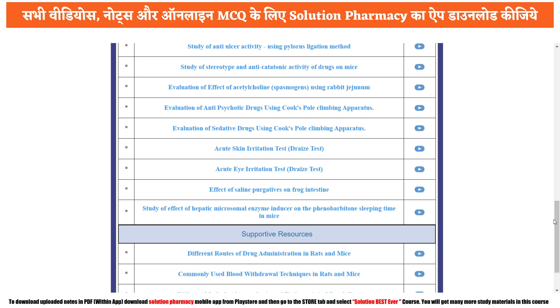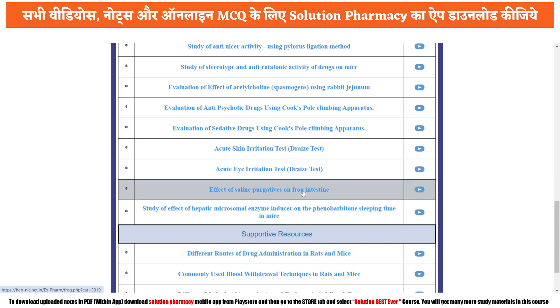Hello friend, welcome to the channel. You are watching xform exclusive video series on Solution Pharmacy YouTube channel. In today's video we are going to demonstrate the effect of saline purgative on frog intestine. We are going to perform this experiment with the help of xform software, which is an excellent alternative for in vivo or in vitro experiments because we do not require any kind of animal.